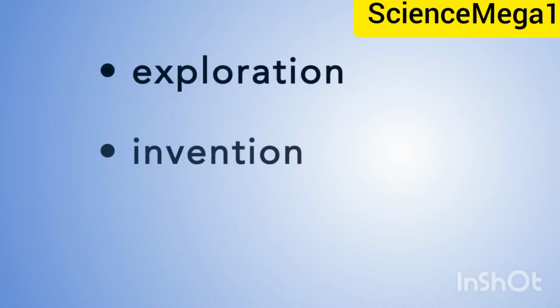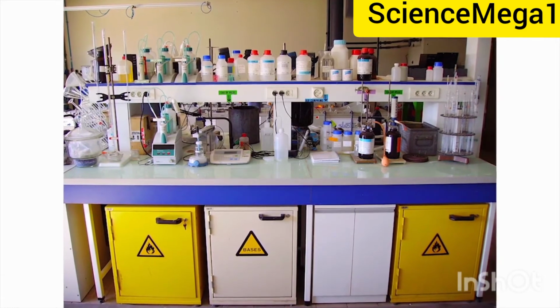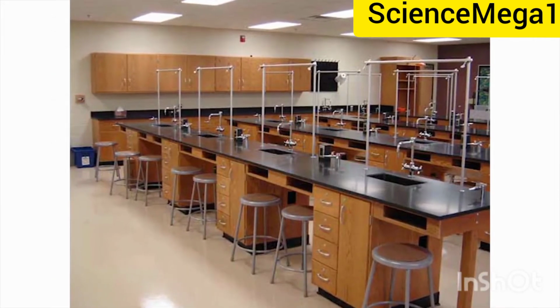The study of science involves exploration, invention, and investigation. Most of these activities are often carried out in the laboratory. The laboratory is a room equipped for scientific experiments or for testing and analysis.